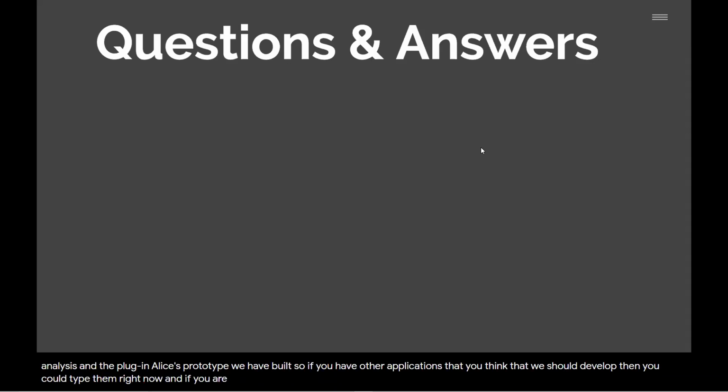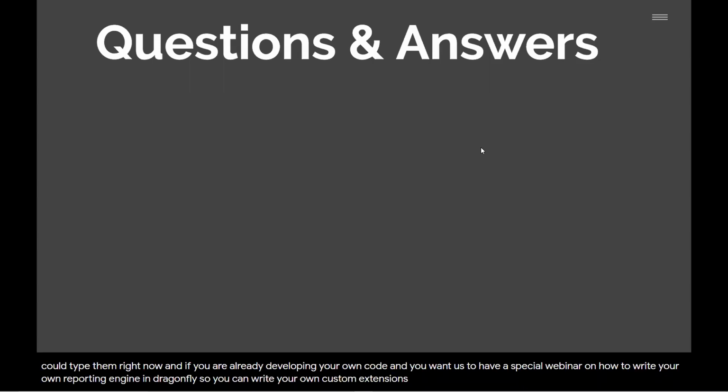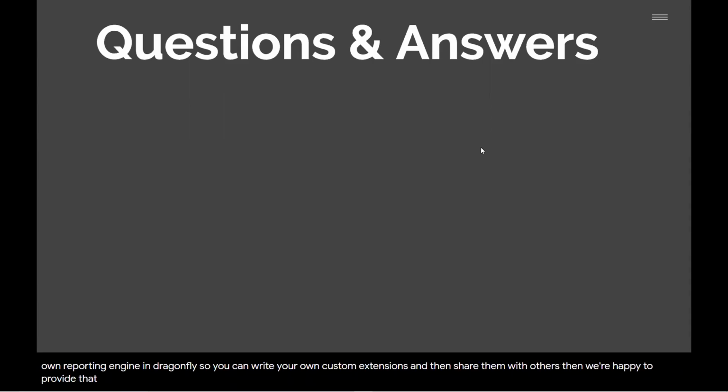And if you are already developing your own code and you want us to have a special webinar on how to write your own reporting engine in Dragonfly so you can write your own custom extensions and then share them with others, then we're happy to provide that. Other questions on reports or on wizards?